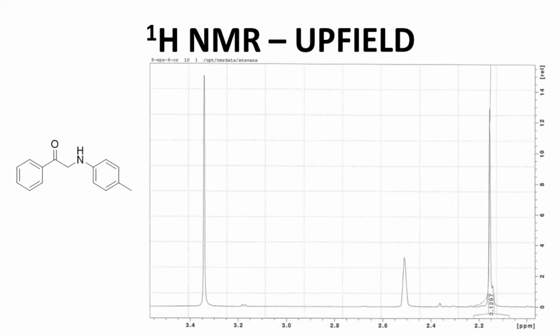Well, there's not much left that we haven't discussed about this molecule. But the one thing that is left is this CH3 group. Now, we're looking at the most upfield region. We already said at the opening that this is our water peak. That's not something we have to interpret. We said this is from some residual protium nuclei in our DMSO. We don't have to interpret that, but this is something we do need to interpret. Notice it's about 3 hydrogens. It's a 3-hydrogen singlet. That tells us that's a methyl group off of our aromatic ring.